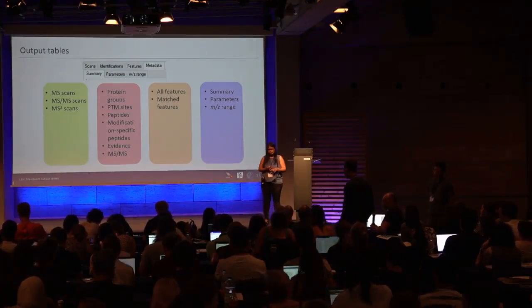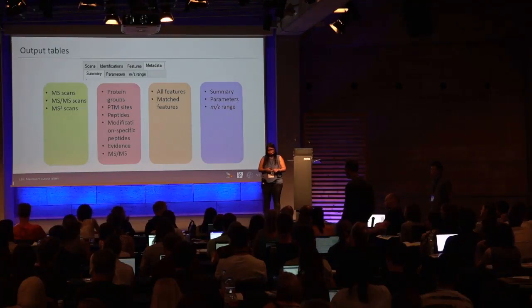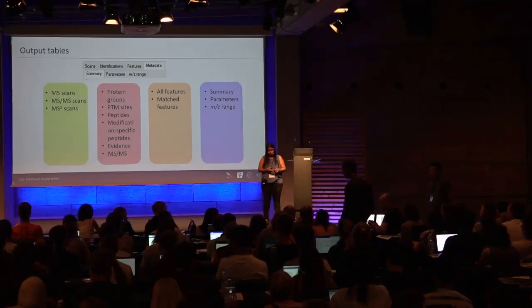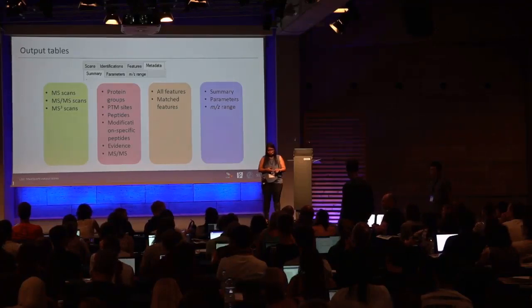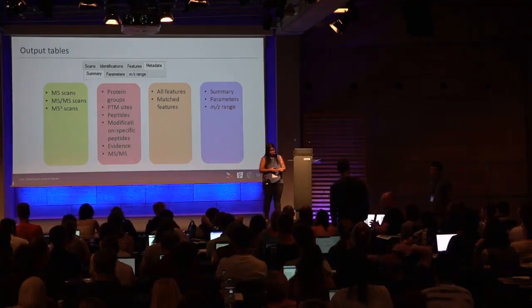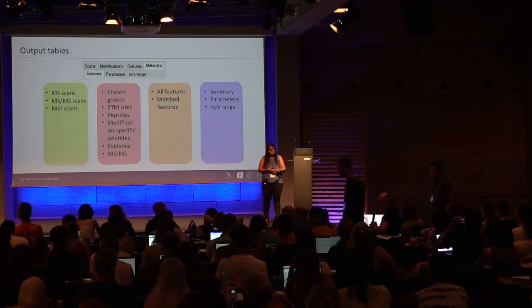Yeah, I understand. It's just that there are many tables, and I think most people are just using the protein groups table, right? And they don't go into the other tables. Exactly. And this would add to the protein groups table and make it bigger, so we're a bit hesitant. Yeah, because I thought it would be nice just to have an extra file, the non-normalized .txt. Okay, but then everybody comes with his extra file that he wants, and then we have 100 extra files, and nobody knows anymore what is in these extra files.